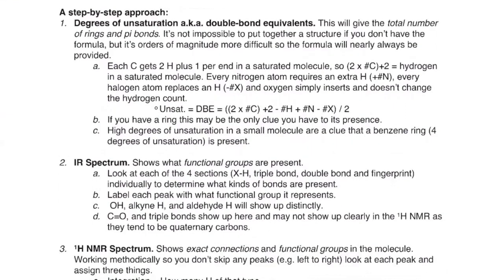We're going to give you points on how close your compound is to our standard. I'm always going to use 10 points for a whole NMR spectrum. Degree of unsaturation, which is the first step, is always going to be 2 points because it's a very standard formula. So here is the formula. You need to memorize that because it's not very hard, and also because it's very useful.